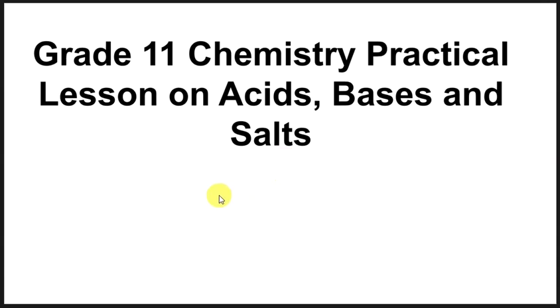All right, so in today's lesson, just as I stated, I'll be teaching you a grade 11 chemistry practical lesson on acids, bases, and the salts.